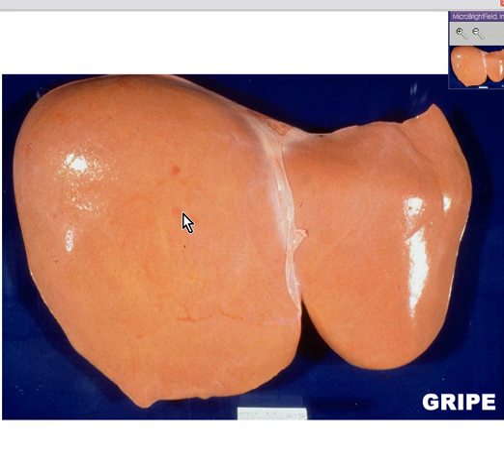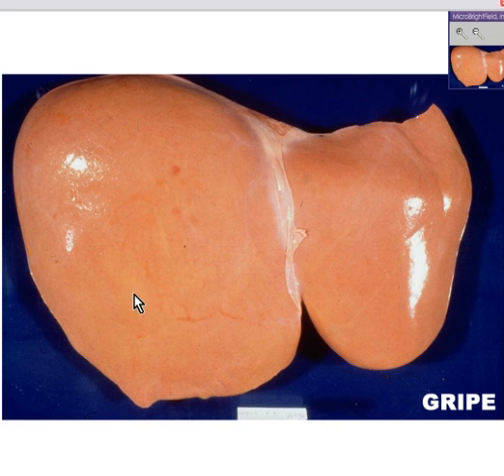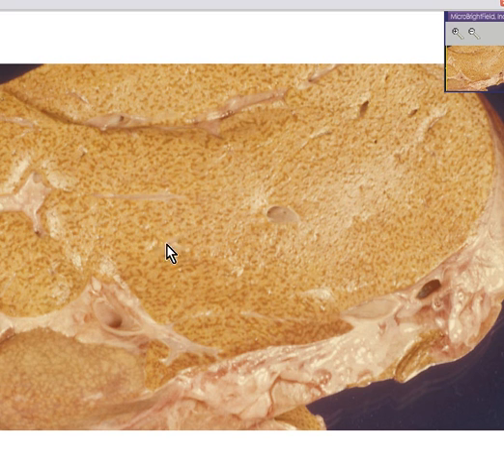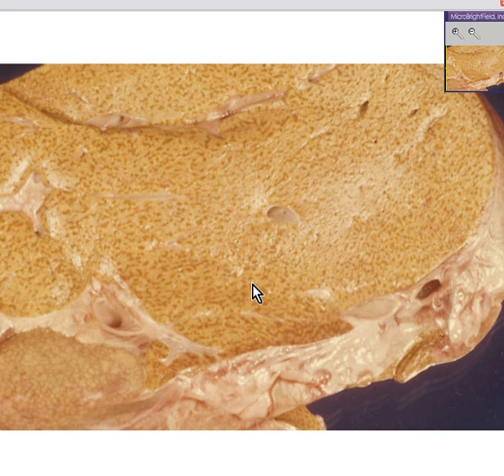Notice that this liver is not as brown as it should be. It is kind of more yellow than it is brown, and here's an area that is almost predominantly yellow. Let's take a cut through that liver. Sure enough, it is quite yellow. You might have looked at the surface of your knife as you cut through it — maybe it was kind of greasy after you cut through it, maybe the surface itself looks a little greasy.